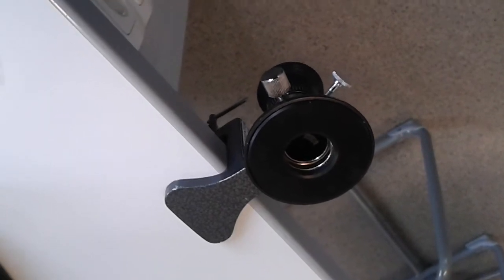In order to make very reproducible sections of the specimen, we use microtomes. Microtomes are able to make sections that have a thickness of around five to ten micrometers. That is already the thickness of a cell.